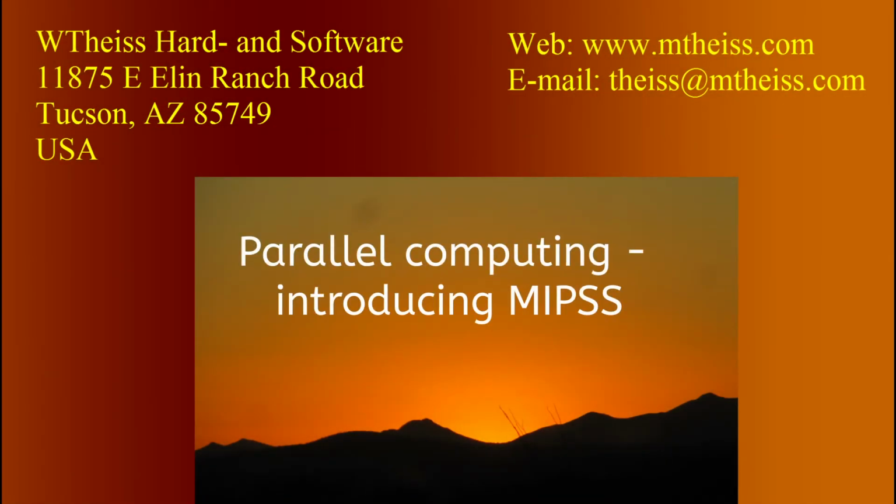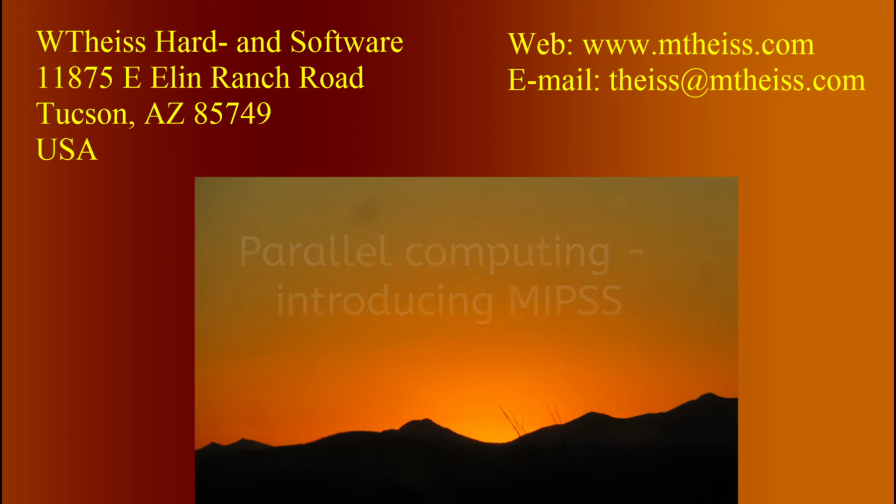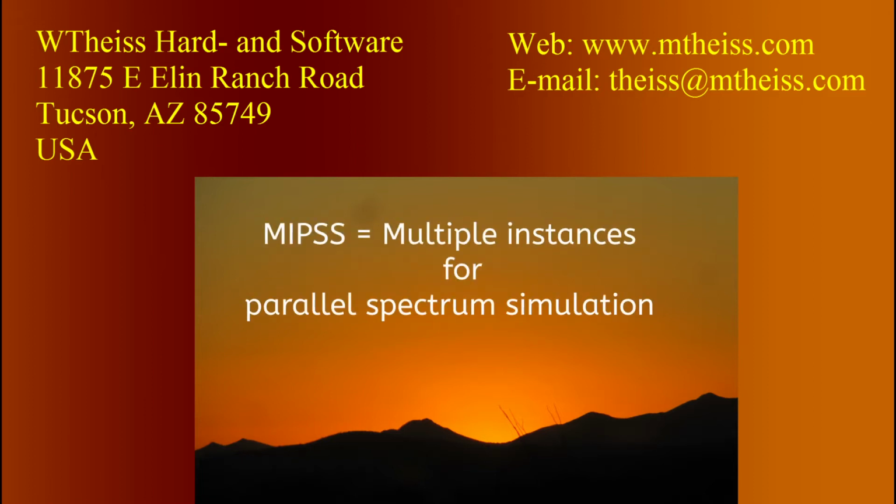Hello, today I would like to introduce you to a new mechanism I have introduced into our software packages called MIPSS. MIPSS stands for Multiple Instances for Parallel Spectrum Simulation, and it will help you to speed up your spectral analysis if you have many spectra to analyze in a short time, or to speed up some design problems on computers which have multiple cores.